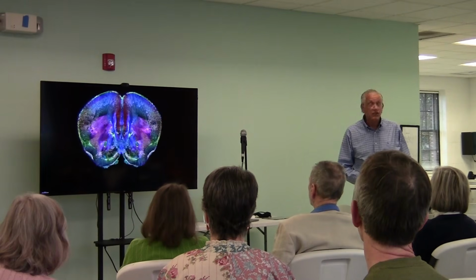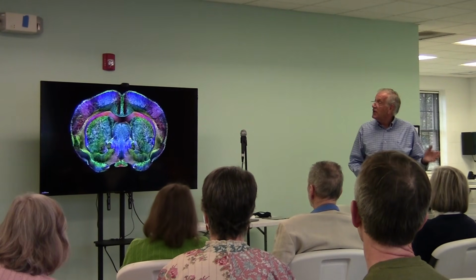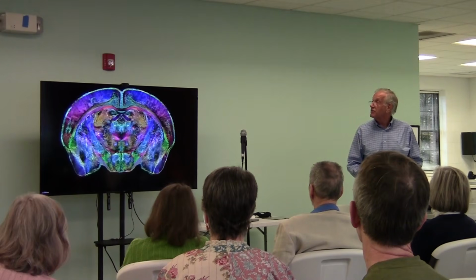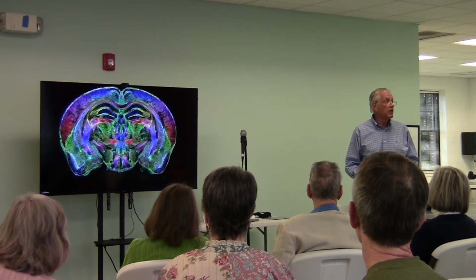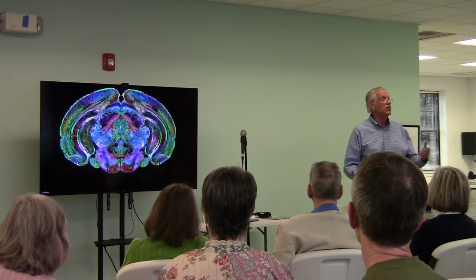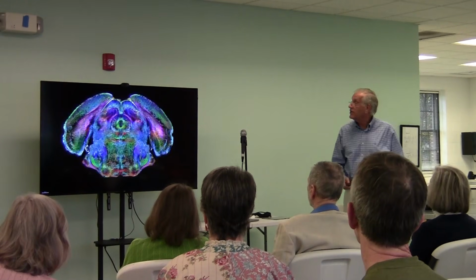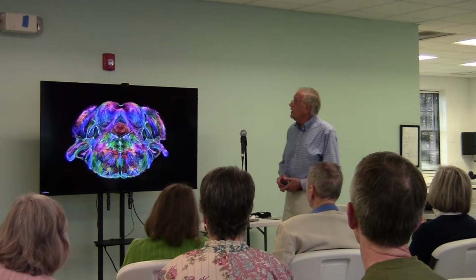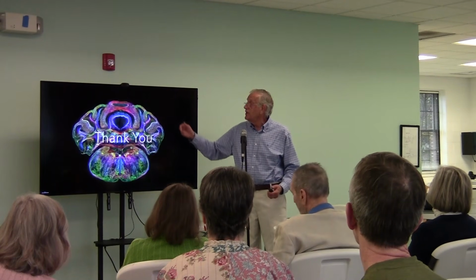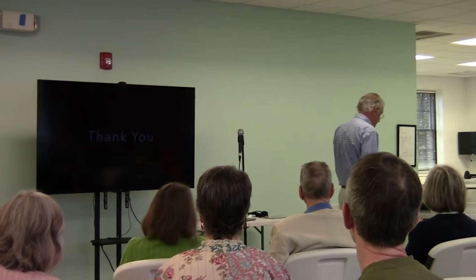Here's the eye candy, some of the Lord's best work. This is a track density image at 5 microns through a mouse brain, color-coded. We're going from the nose through the hippocampus. It's color-coded like I mentioned earlier, all the way through. I can zoom in on these. The screen here is not big enough to accommodate this. So with that, I'm finally done.